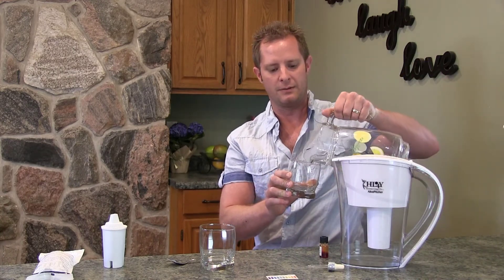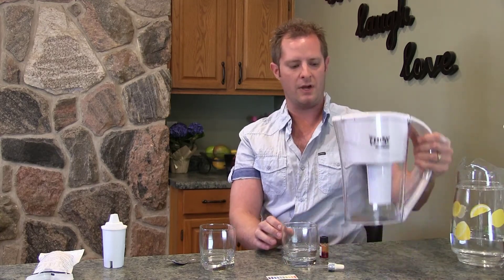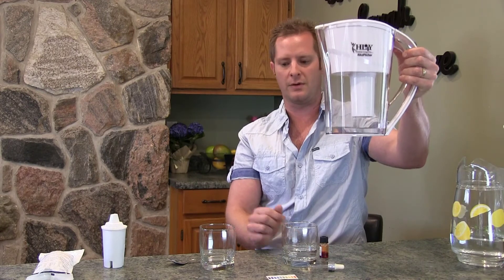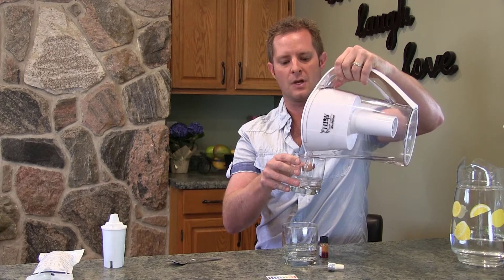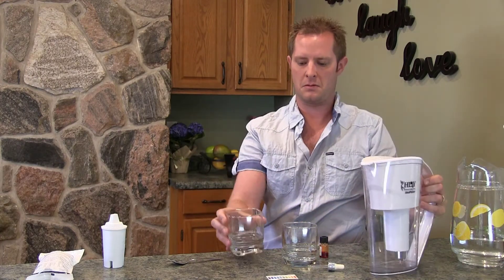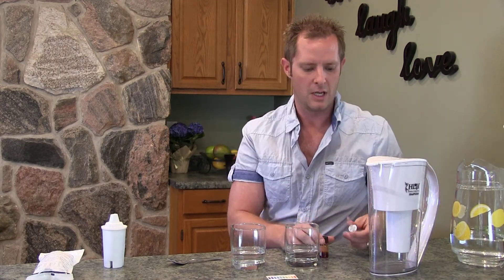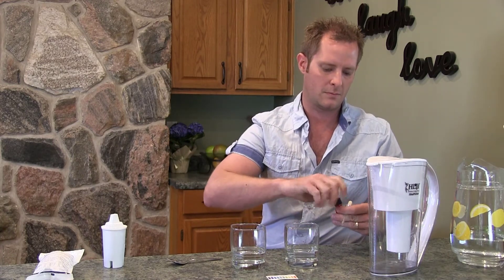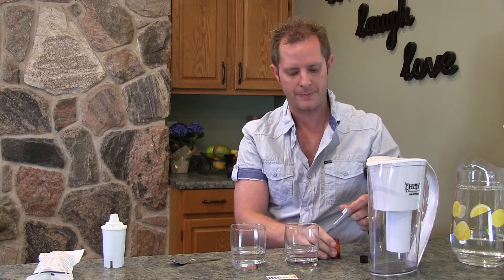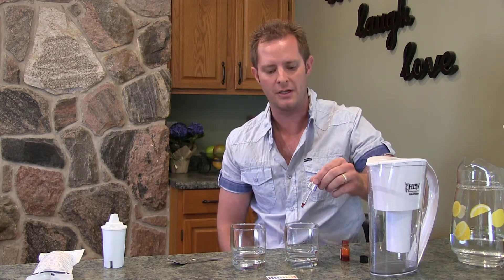I'm going to take the regular water in this glass and put a little bit in the bottom. Some of the Alka Pitcher water has already filtered through — it goes faster if you fold it up higher. I'll get them roughly even, then give each a little shake, open up the dropper, and put just a little bit in — we're only doing two drops in each glass.